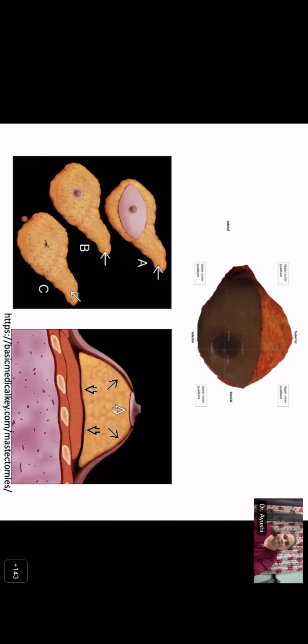Now, the mastectomies can be simple, modified radical, skin sparing, or nipple sparing. I'll explain these in a moment, depending on the extent of excision. Then you can also have completion mastectomy, whereby the patient has undergone a wide excision or even a mastectomy earlier. And these days, with increasing cosmesis, you can also have reduction mammoplasties.